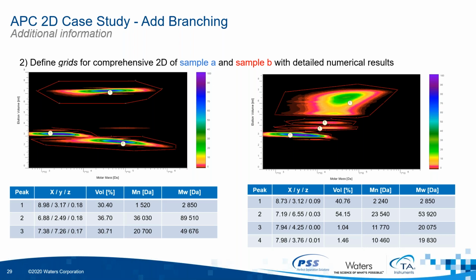Knowing that the graft polymers are sort of copolymers and having all those nicely separated fractions, you might ask yourself, is there a way of determining composition? Can I get even more out of my 2D experiment than superior separation and molecular weights? Yes. This has not been done with this particular analysis, but it is generally possible using the chemical heterogeneity module of WinGPC.